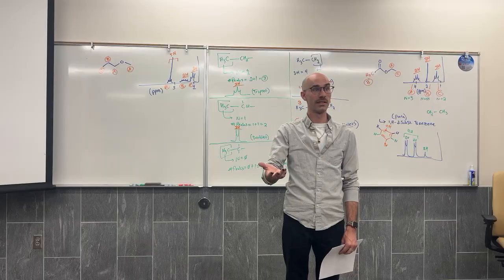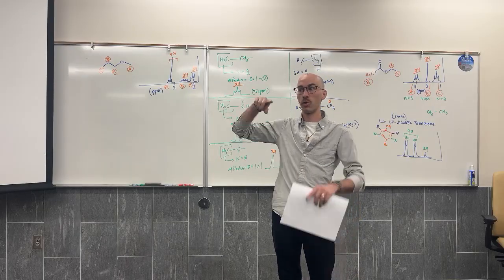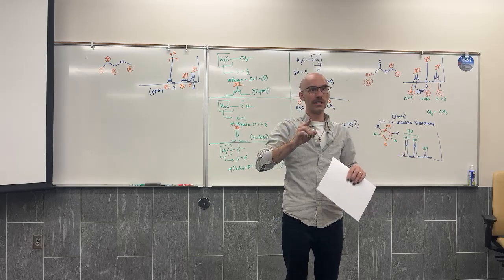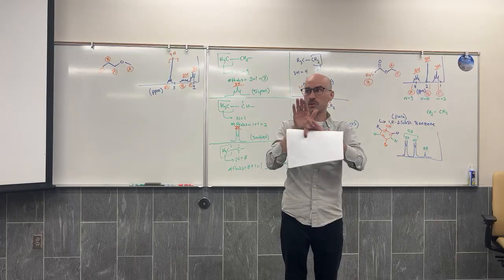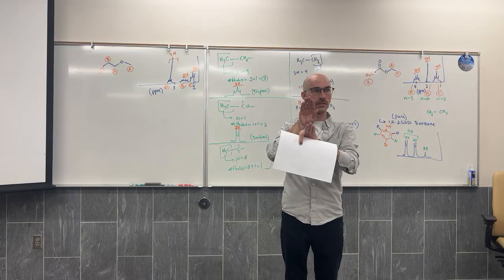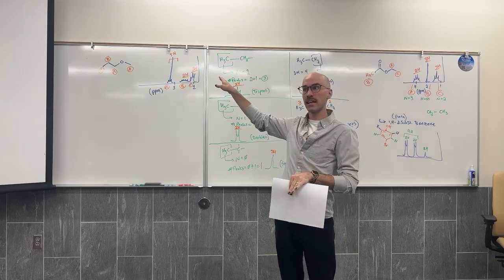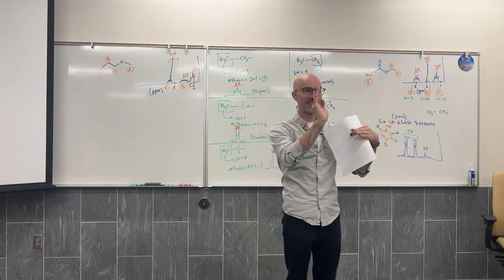That's not a bad way to do it. But if you were to get in here with the software, it would only be able to integrate them together because they're together. And actually that's not true because the software has gotten very good at being able to pull apart different peaks that have overlapped with each other. This is amazing that they've overlapped dead on with each other.